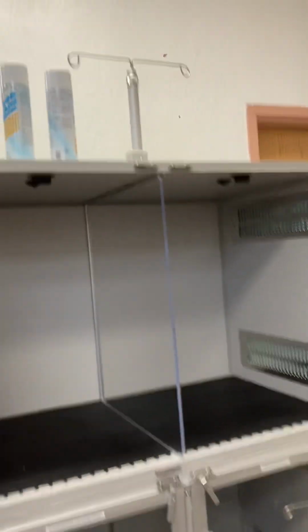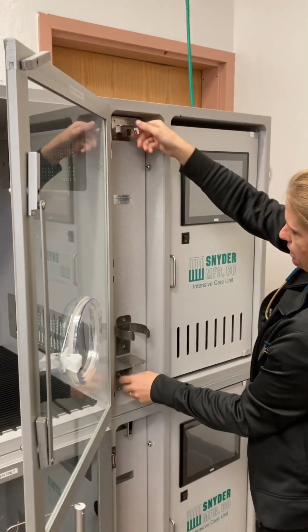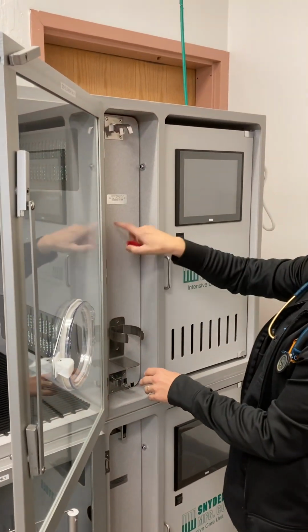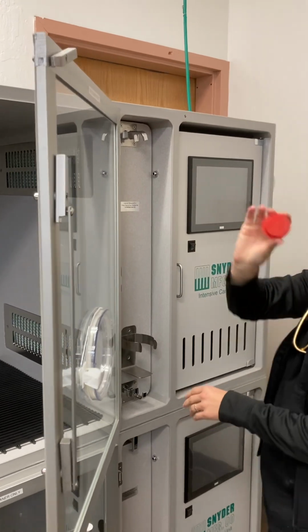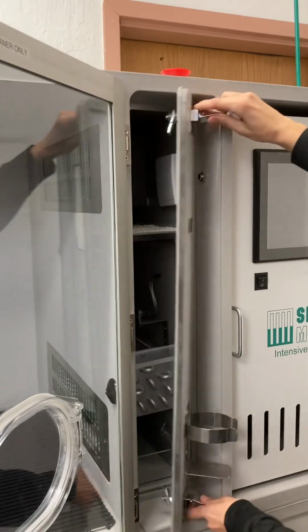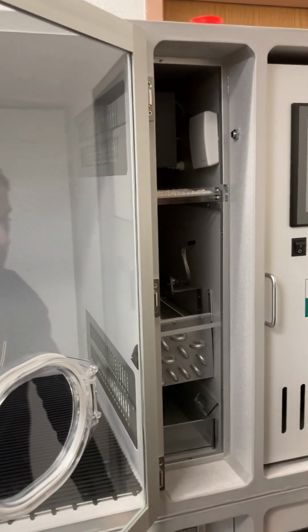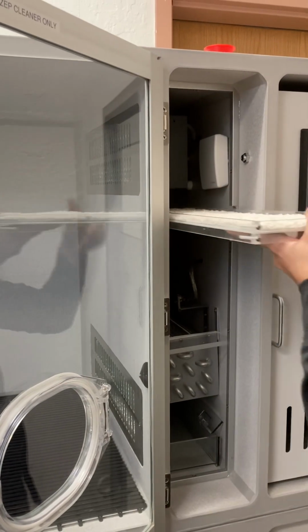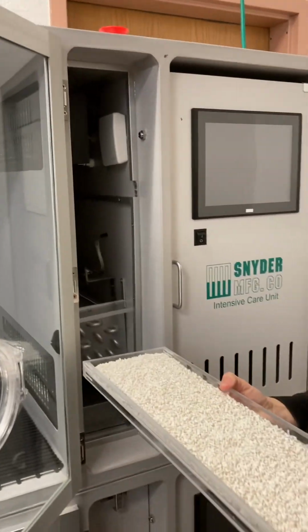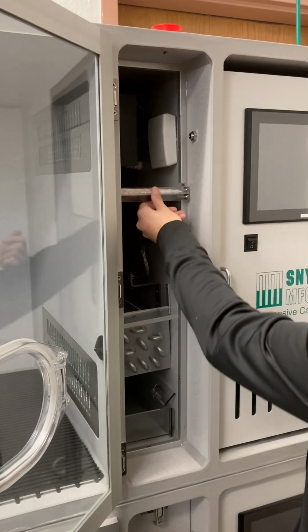The next thing you need to do is pull over to compartment B and check that soda lime is good and the drip tray is dry. You have to remove this little red cap, and then the door comes out at an angle and you just pull it down. Be careful not to set it on the touch screen below. Soda lime's in here. You need to make sure that it's not purple and it's only 2 to 3 granules thick. This soda lime looks fine.